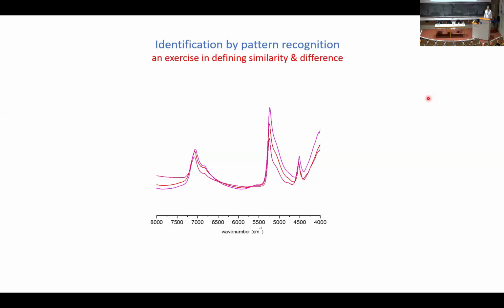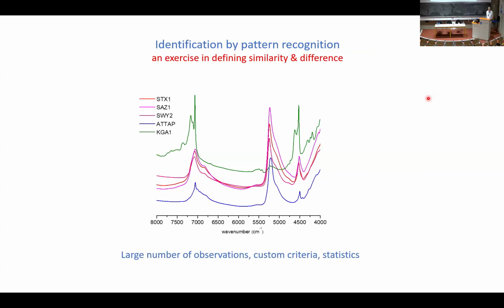Here are a few more spectra. If the first one was a montmorillonite, are the other two montmorillonites or not? You're not supposed to know. Don't try to answer. Is this sufficiently different than the previous, the green and the blue? Now you can probably say yes.